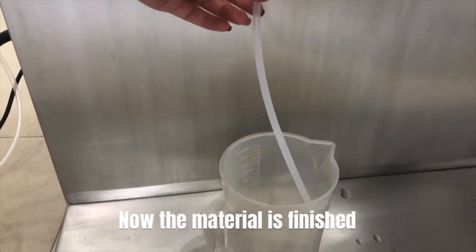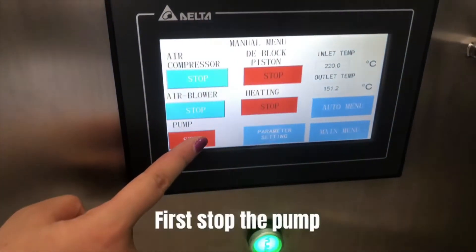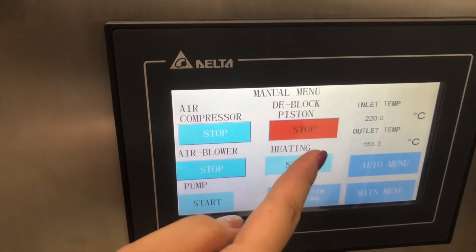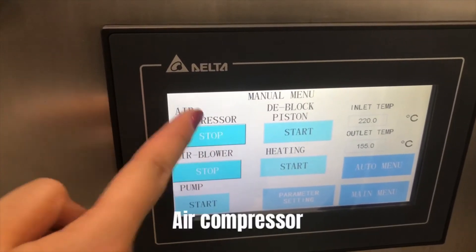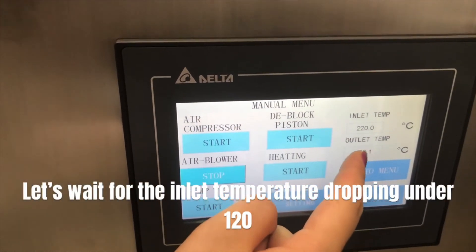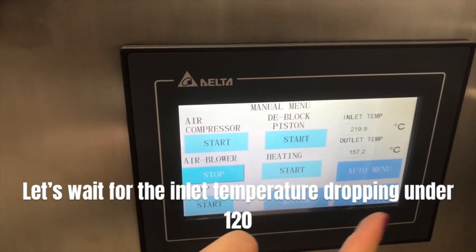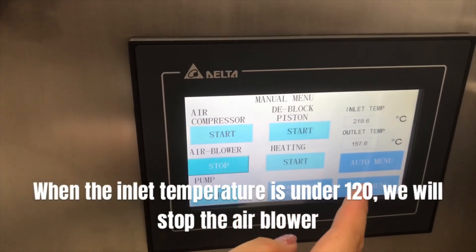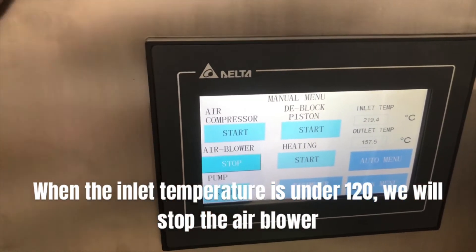Now the material is finished. First, stop the pump, then stop the heating, then the D-block piston, then the air compressor. Let's wait for the inlet temperature to drop under 120. When the inlet temperature is under 120, we will stop the air blower.